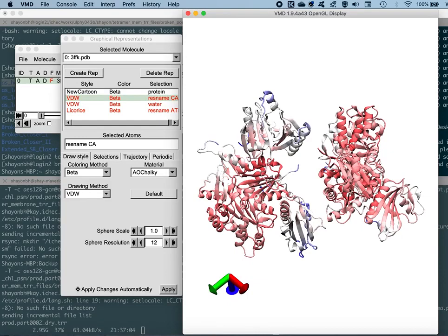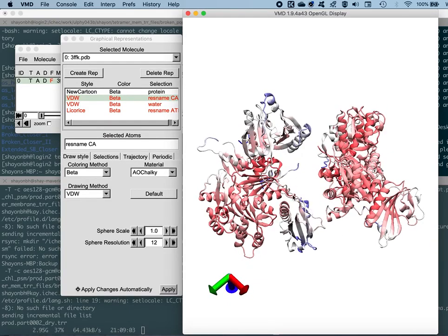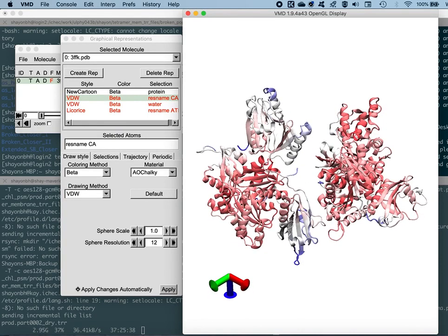Especially the actin regions are very red in nature, which means unless the ligand binds to this gelsolin binding site, the PIP2 binding site of gelsolin, the gelsolin and the actin complex will not separate from each other or not dissociate from each other. And since this is not a ligand-bound structure, that is, this is an apo structure, which means the gelsolin and the actin complexes will stay together. Okay, so this is like a proof of concept from the mechanistic point of view as well.